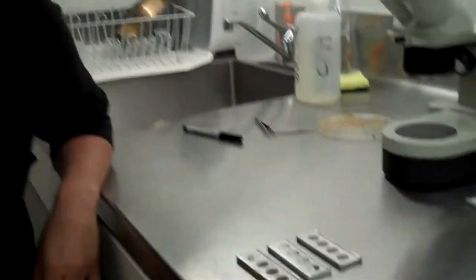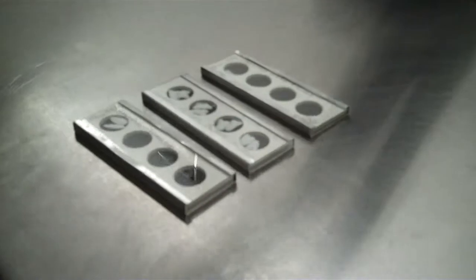After we pull all the otoliths from the pellet, we identify the fish that they came from. Each otolith is unique, as you can see from these slides.